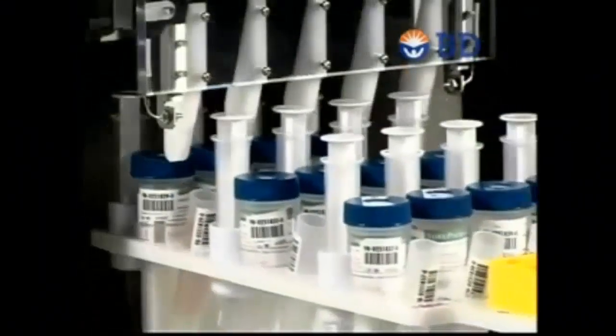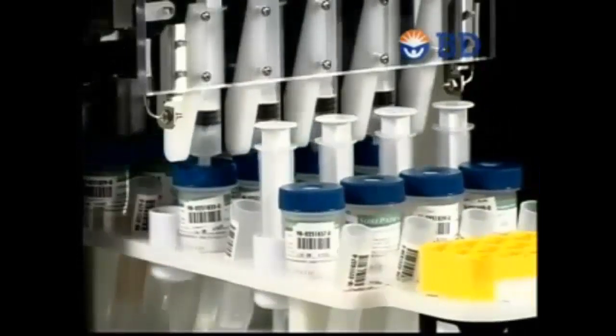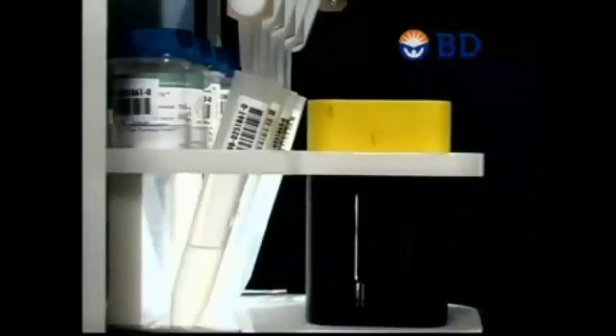Once started, a disposable PrepMate syringe is loaded and pierces the cap of the SurePath sample vial, mixing the solution to randomize the cellular contents. Eight milliliters of sample solution are then withdrawn from each vial and layered onto the density reagent within the corresponding centrifuge tube. This process automatically repeats for each loaded sample.